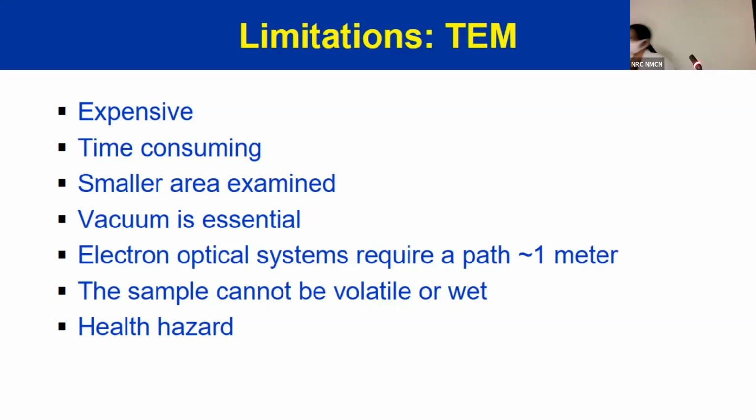What do you think an electron microscope would cost? Depends again on the type of microscope, but a basic one will not be less than 2.5. A basic one, I'm talking about. The ones that the IITs have would be quite high, depending upon how much they can resolve.